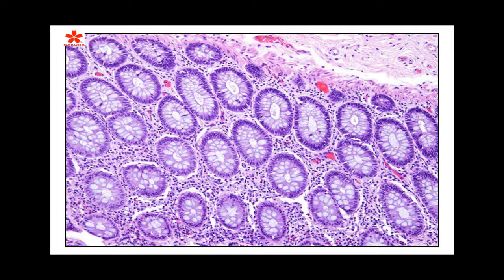A section of colon, what you're looking at, a cross-section of these glands with numerous goblet cells. So I want you to rate this also. Once again, there's no right or wrong. It's however you view this slide.